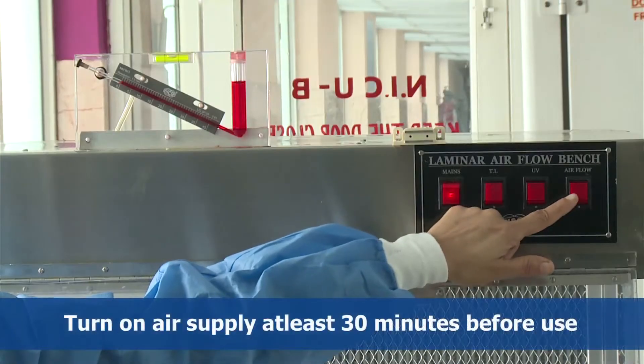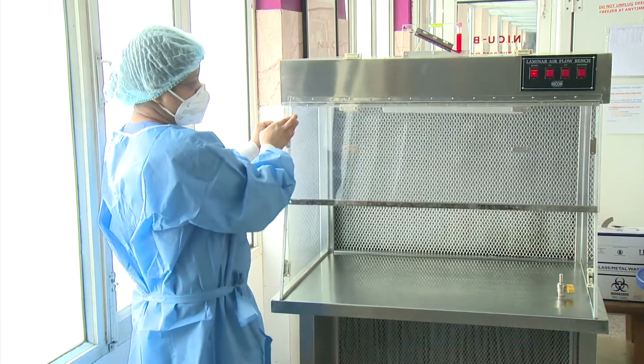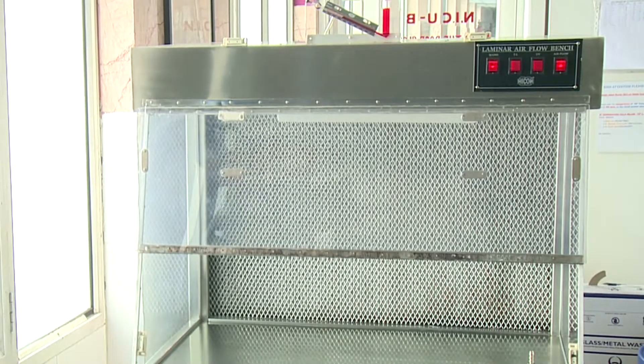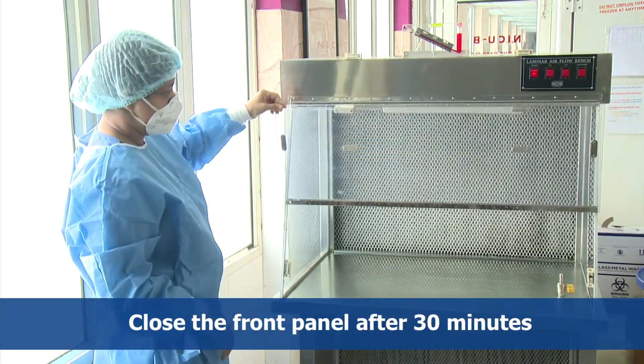Turn on the air supply at least 30 minutes before use. Keep the front door open during this time so that the non-sterile air can be replaced by clean sterile air. Close the front panel after 30 minutes and leave the blue UV light on for a period of 30 minutes.